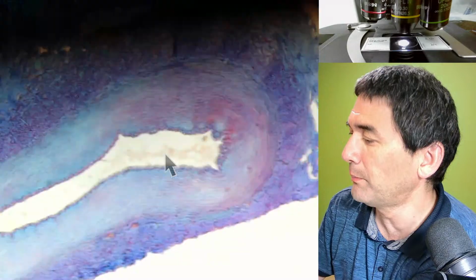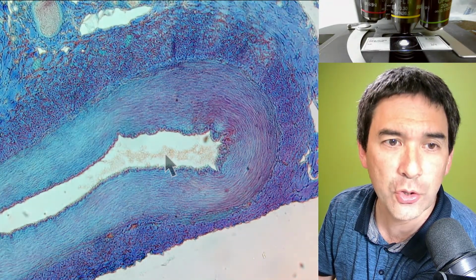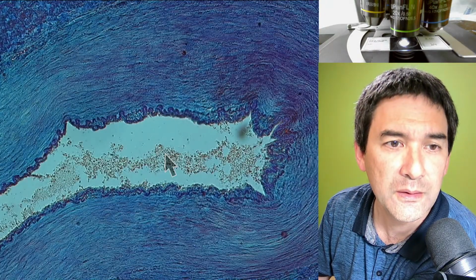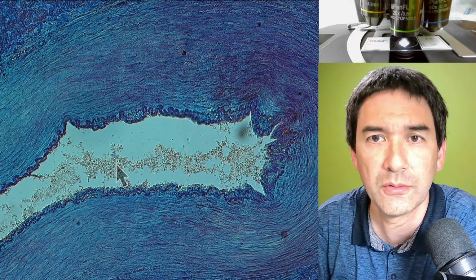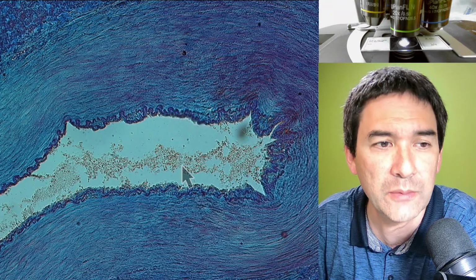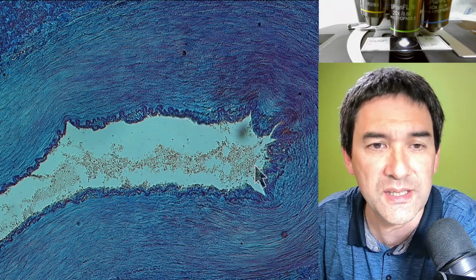Forgot to do some of the adjustments of the microscope here. Let's go up with the magnification. And what you see in here, those dots, these are also red blood cells. The magnification is only now using my 20 times objective, so the red blood cells are much smaller. And they're also kind of sticking together. That's why we cannot see them as individual cells.